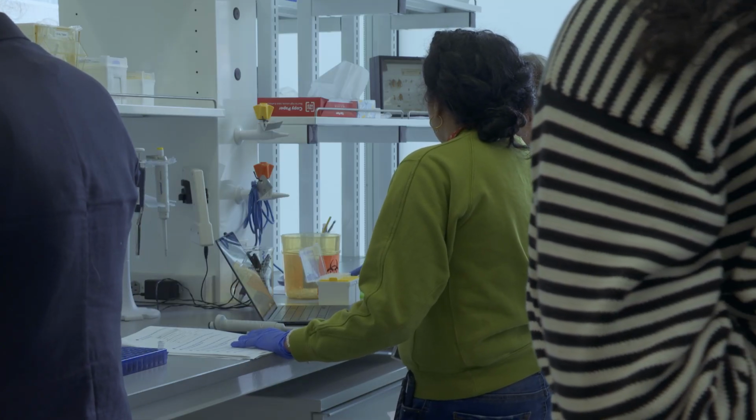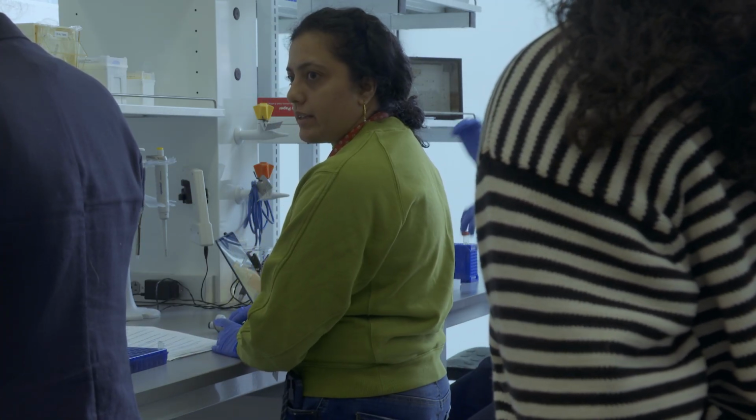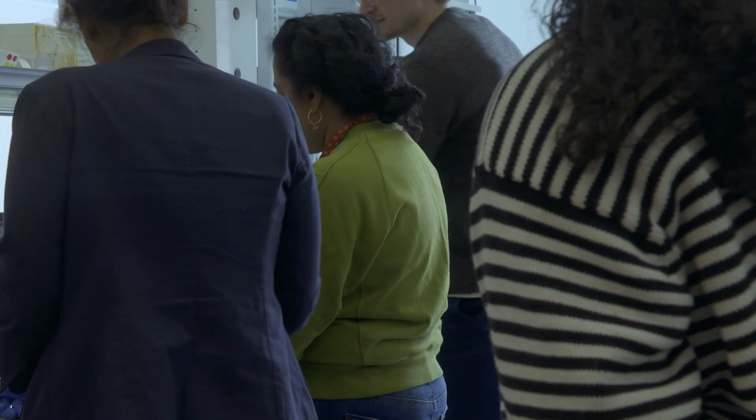Okay. Yep. So that should be 20 microliters of each sample. So I'm directly adding 3.9 of enzyme in each one. Yes, please.